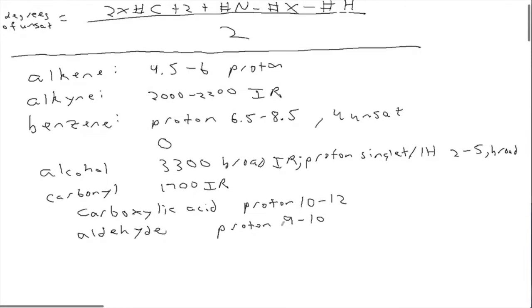Okay. It's also possible that you might see things with nitrogens, but you can look those up in your table separately if you need to. So these are a few particular functional groups, peaks that are worth especially focusing on and looking for.